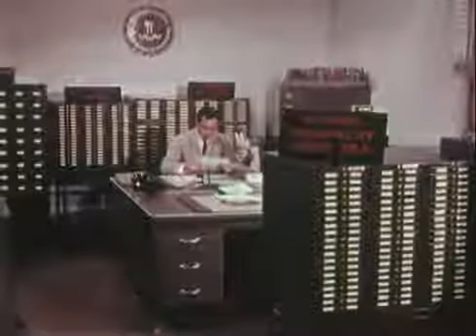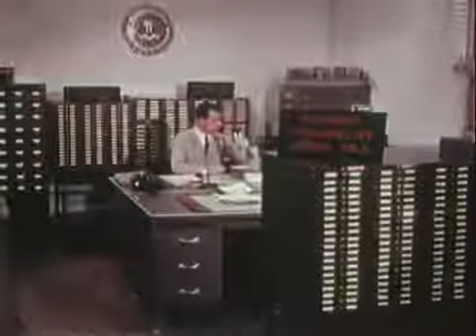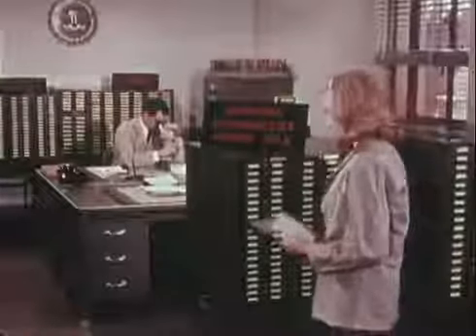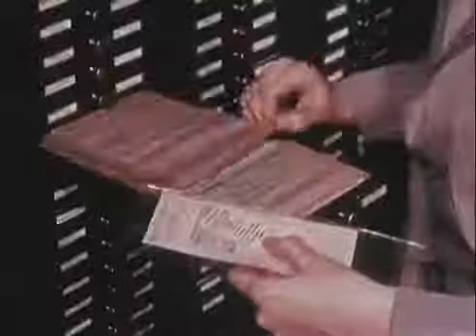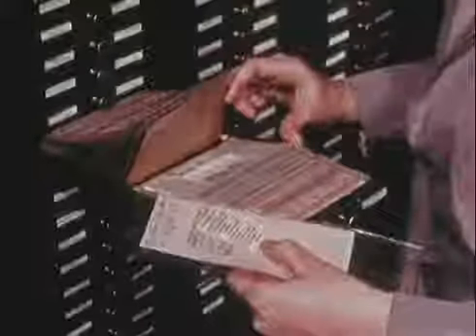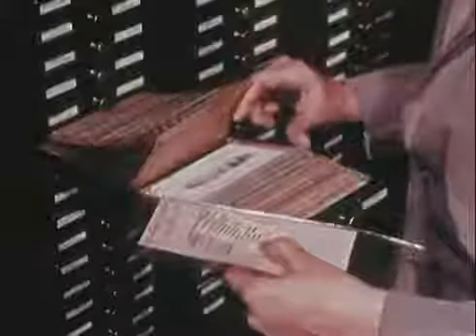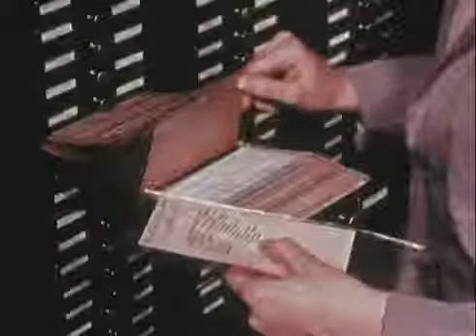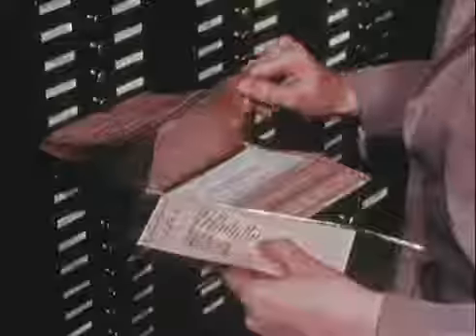The document section of the FBI laboratory maintains and uses the National Fraudulent Check File to aid local law enforcement agencies in bogus check cases. The file contains perhaps the world's largest collection of bogus checks and of signatures used by professional check passers. Trained technicians search the file for similarities with checks submitted for investigation by local law enforcement agencies.